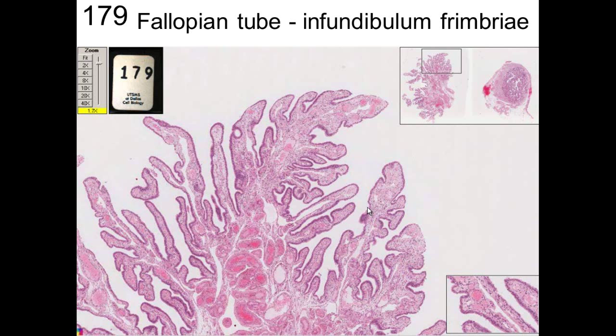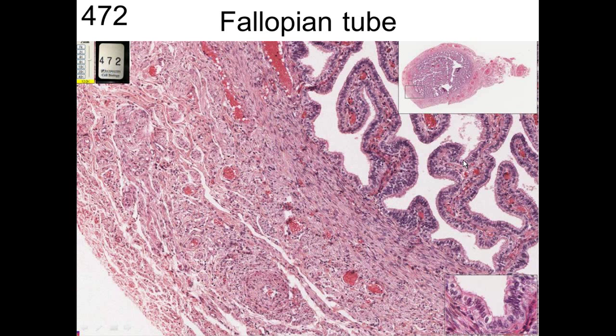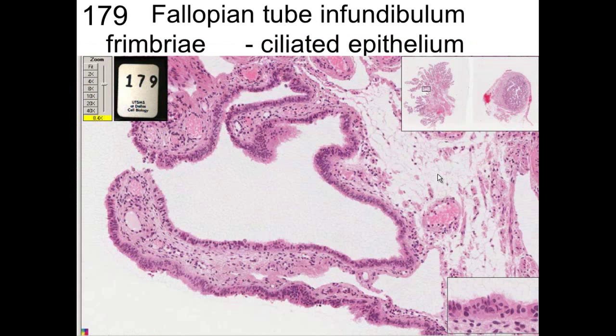If you look at these, there are ciliated cells on the surface of connective tissue. There's blood vessels, but there also are lymphatics. Lymphatics in through there kind of help hold it rigid and hold it open. So you can see lymphatics in there. Also, you can see that there are some true ciliated cells in there as well.